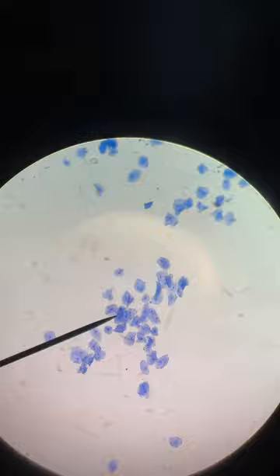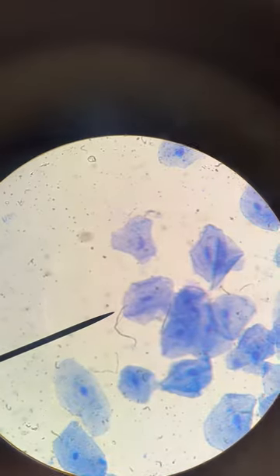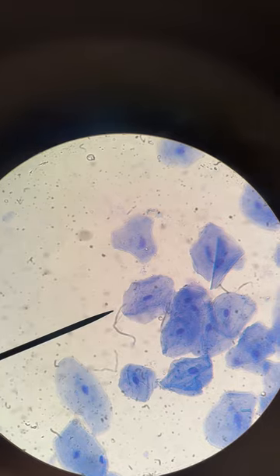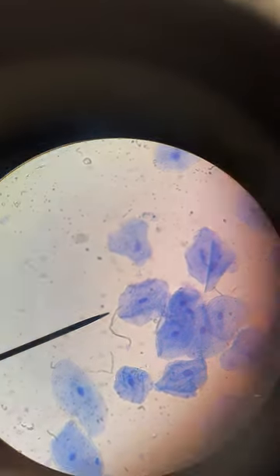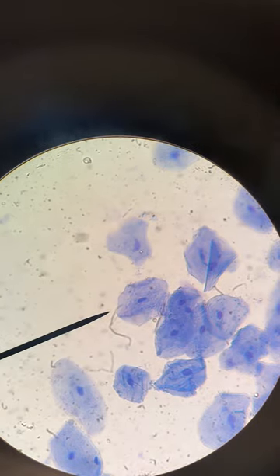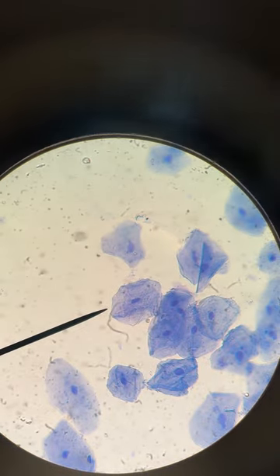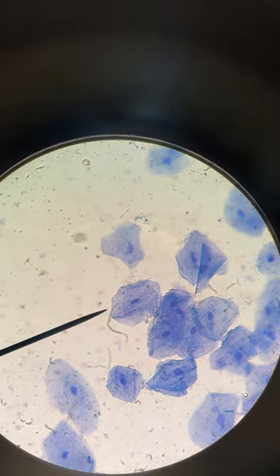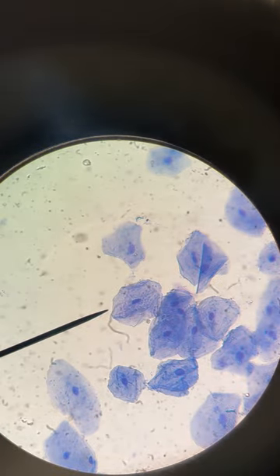Then go to blue objective. On blue, you're going to use the fine adjustment knob. You can really see the cell membranes on the outside, the cytoplasm, and the nucleus. Those dots might be some ribosomes — I'm not totally convinced, but nevertheless those are good. I count about 20 to 25 cells right here that you could draw for blue.